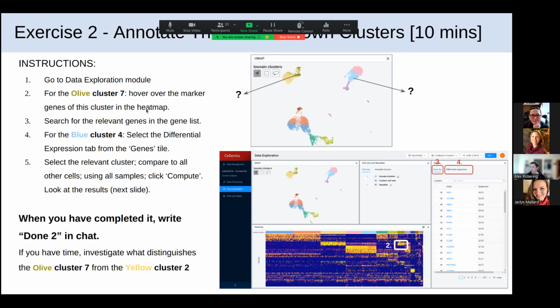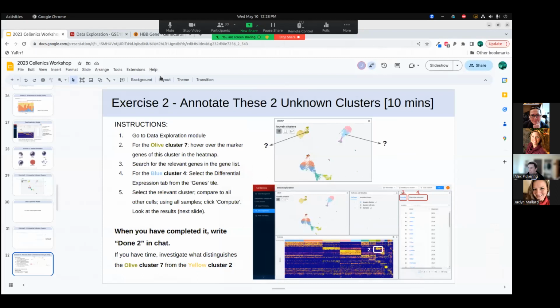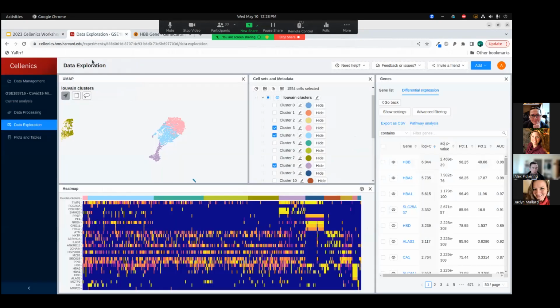I'm not sure that I can give you a mathematical justification for when it's reasonable to create your own custom cluster. I think as with anything, you want to exercise caution and make sure that you have a reasonable justification.